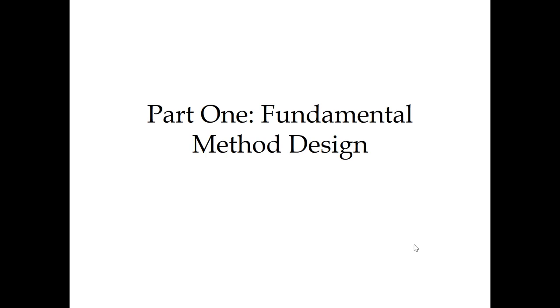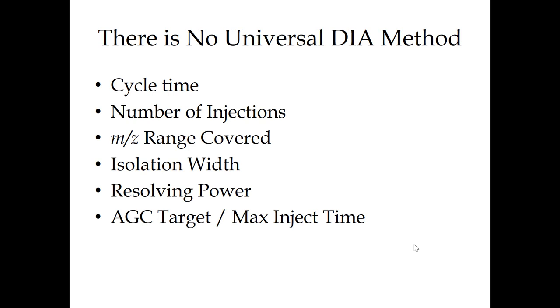All right. So thinking about fundamental method design for DIA. I don't think there's really a universal DIA method. We're still not to the point where I can just tell you to always use this particular DIA method. So while I'm telling you our starting point for most things, keep in mind that there are a lot of variables in these methods, and depending on your time constraints or the amount of instrument time you have, the number of injections you can do with your sample, the complexity of your sample, these parameters might change.